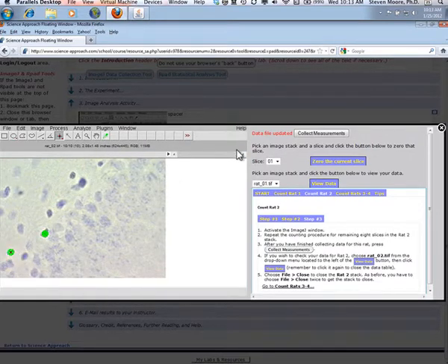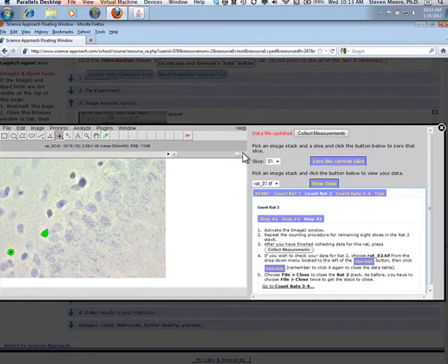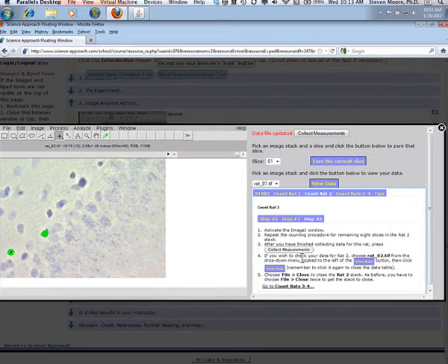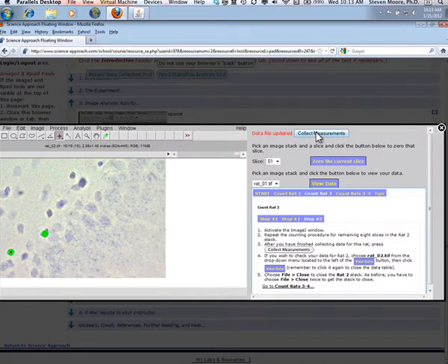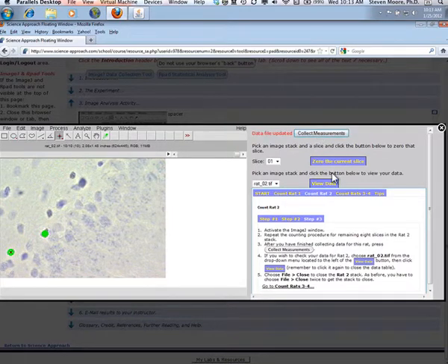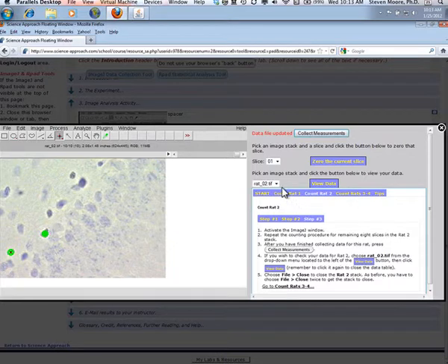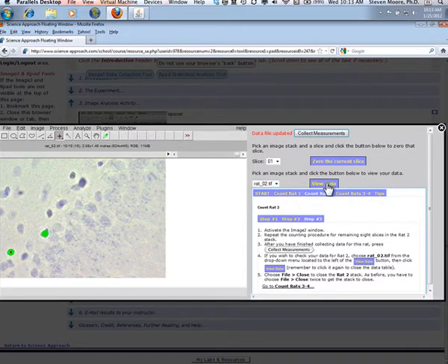As before, when you finish counting the cells for a stack, click the Collect Measurements button. If you wish to see your data, click the View Data button.